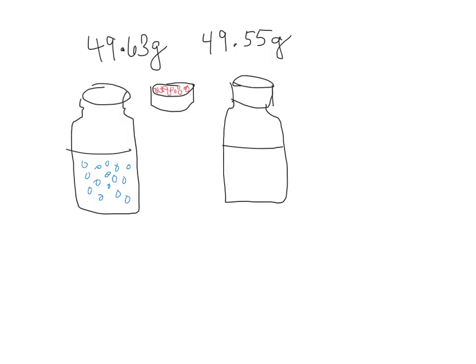You all should make paper funnels. They work well. 1, 2, 3, 4, 5, 6, 7, 8, 9, 10, 11, 12, 13, 14, 15. I have 15 water particles, and I haven't transferred all of my sugar particles into the vial. So I'm going to have 7, and 3. Meaning I spilled some sugar. Some of it did not make it into the vial.